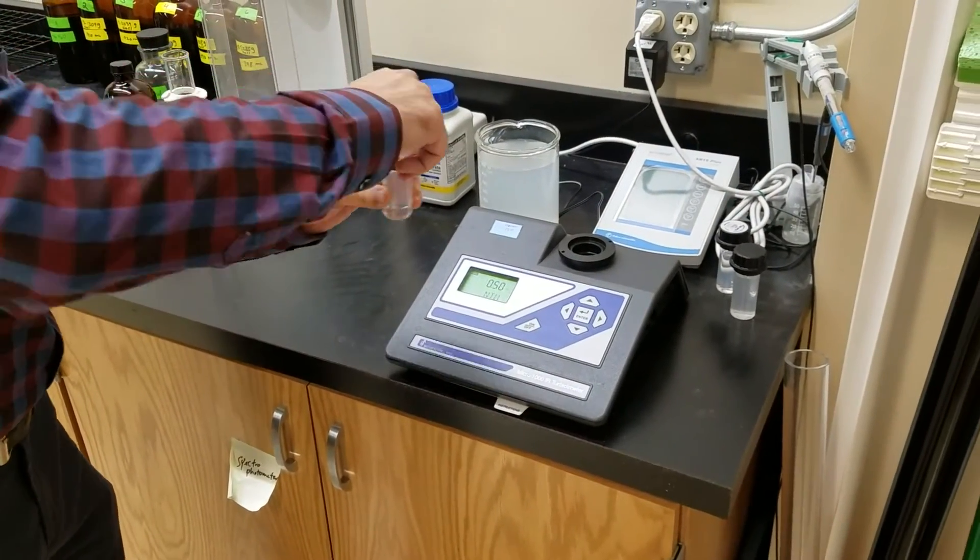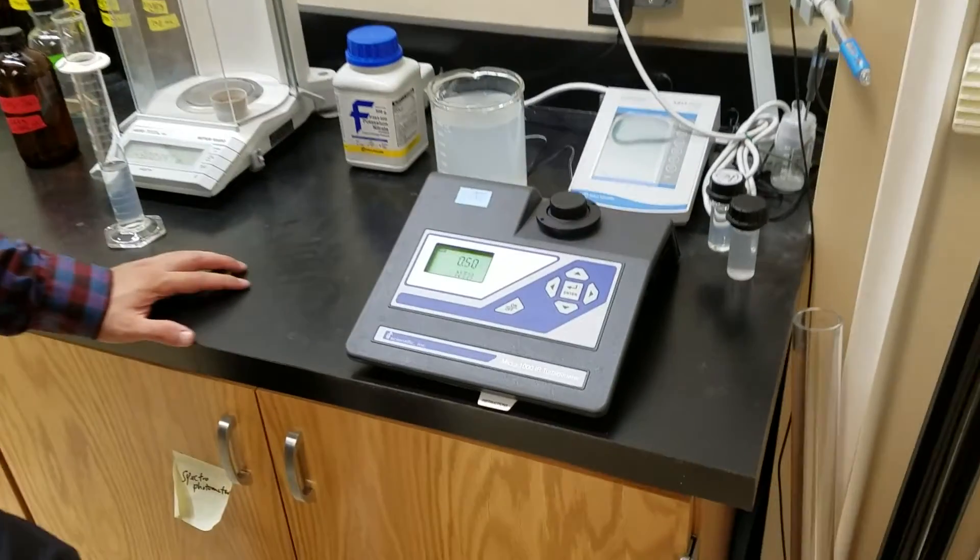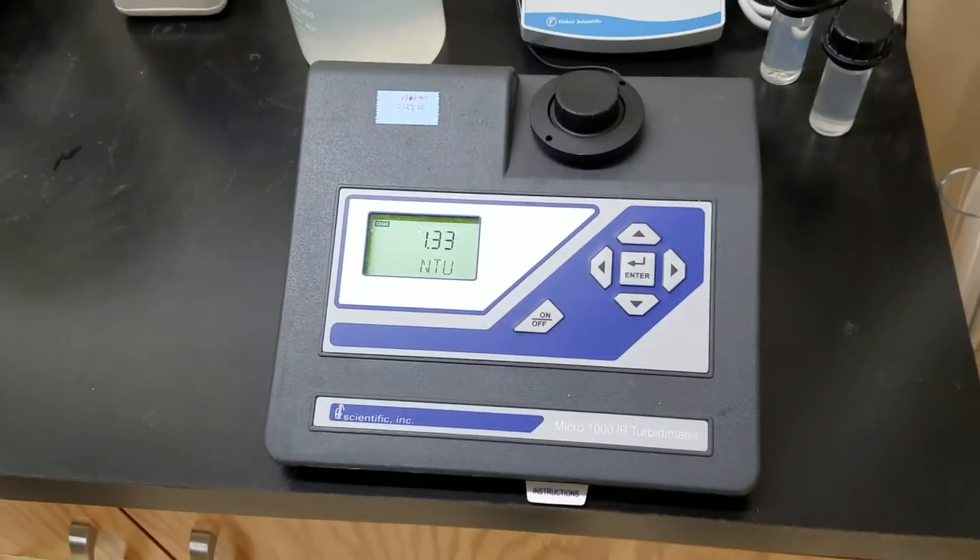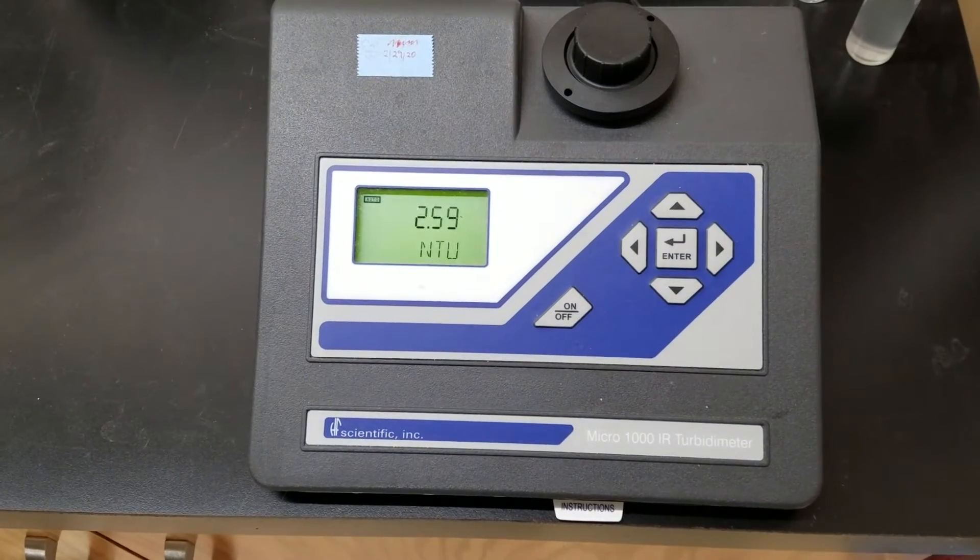Do you remember the turbidometer from the solids lab? Do you recall what turbidity tells us about this solution? Go back to your solids lab and take a look.